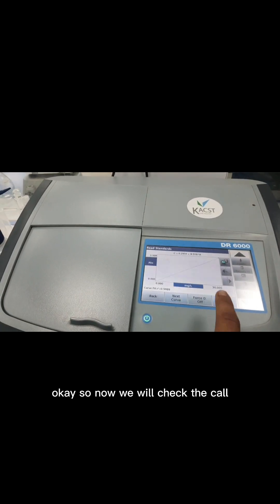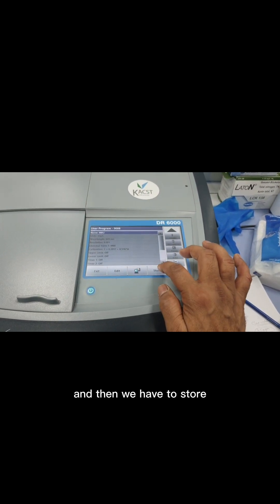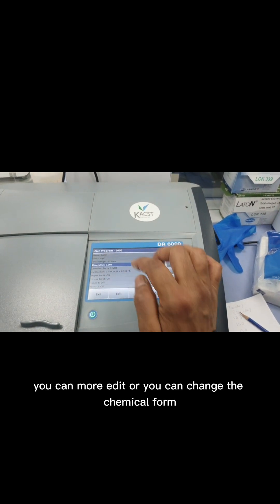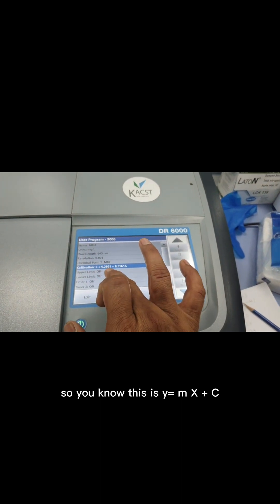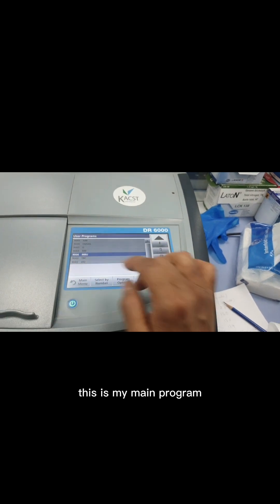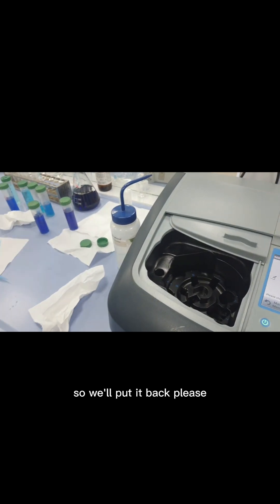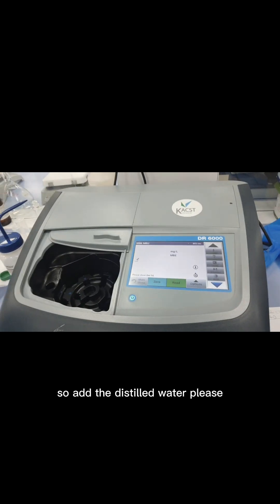Now the calibration R² value is 0.989, which is very good. Select Done and then Store to save the calibration. If you want to edit anything — the chemical formula or any values — you can do so using the Edit option. This is the calibration equation in the form y = mx + c, where m is the slope and c is the intercept. The calibration is now stored.